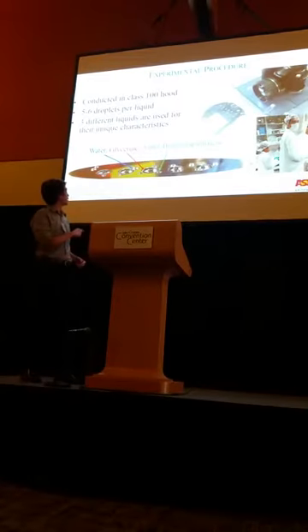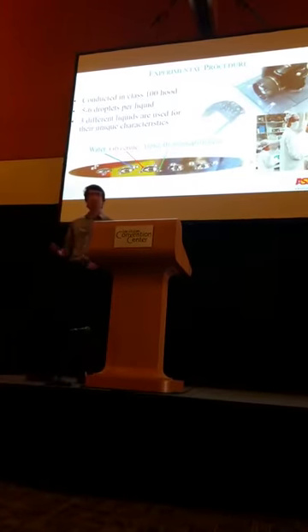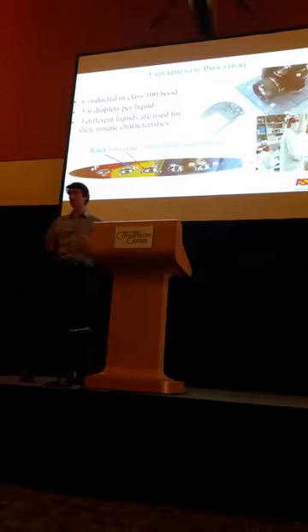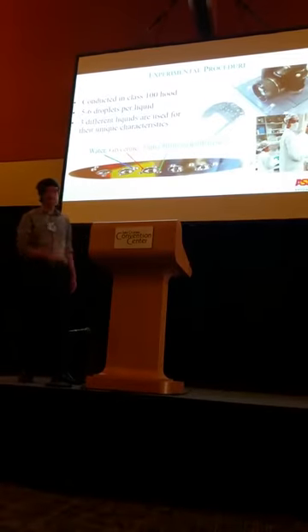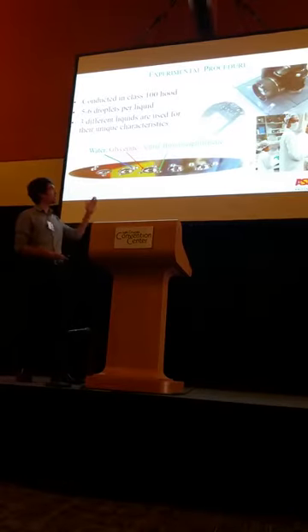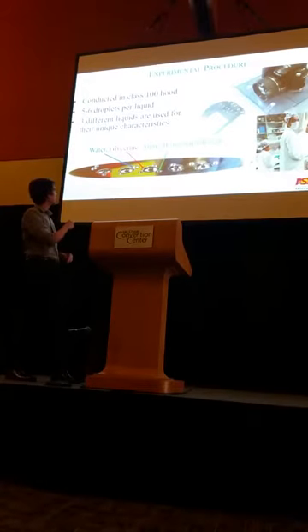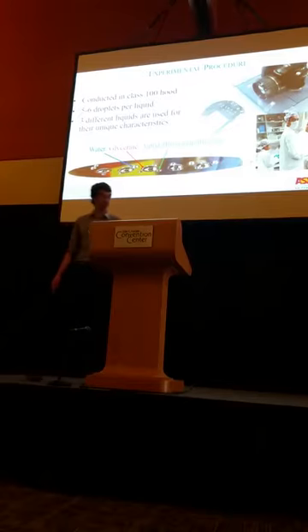We also use 3 very different liquids for our analysis. We use water, glycerin, and alpha-bromonaphthalene. This is because they each have very unique characteristics and they give us very distinct values for the contact angle. These 3 liquids are also very useful because their surface energy is very well understood, and because by using these 3, we evaluate two polar liquids and one non-polar liquid. Water and glycerin are both polar, while alpha-bromonaphthalene is non-polar.